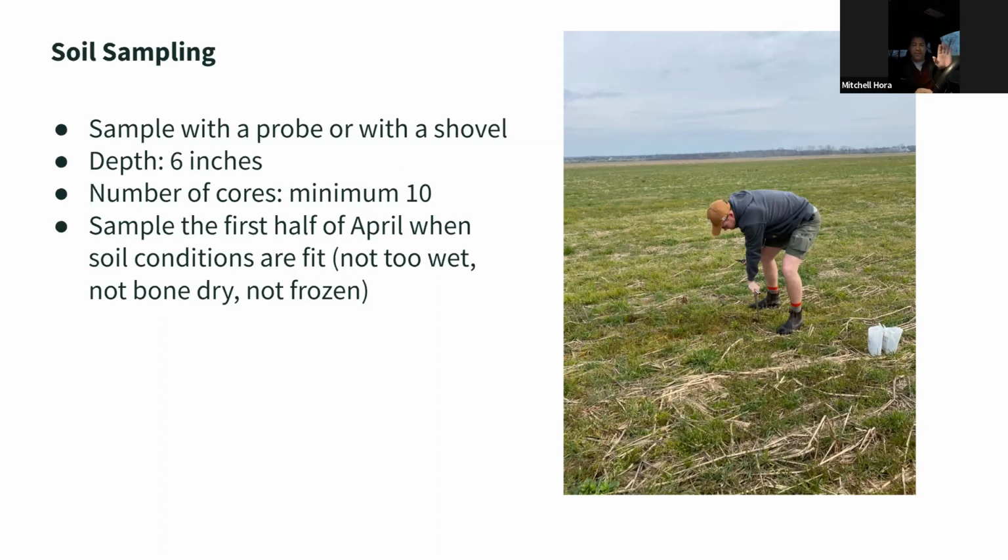So if you're going to do one sample from, say, the field on the west side of the road versus the east side of the road, just encompass the entire thing in that one field boundary. The key versus how you would typically do it: if you do east field versus west field on TopSoil, you can only view one field at a time. You can't view a bunch of different fields side by side.